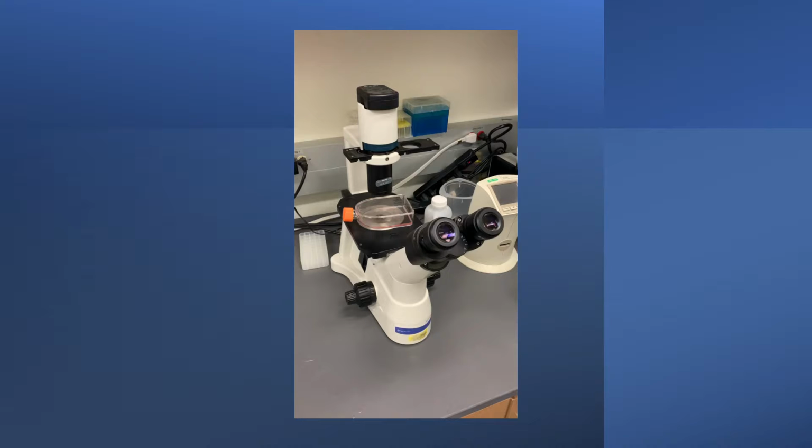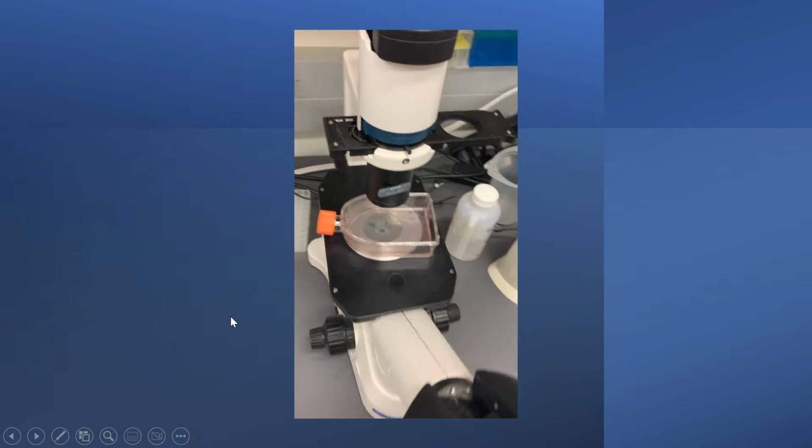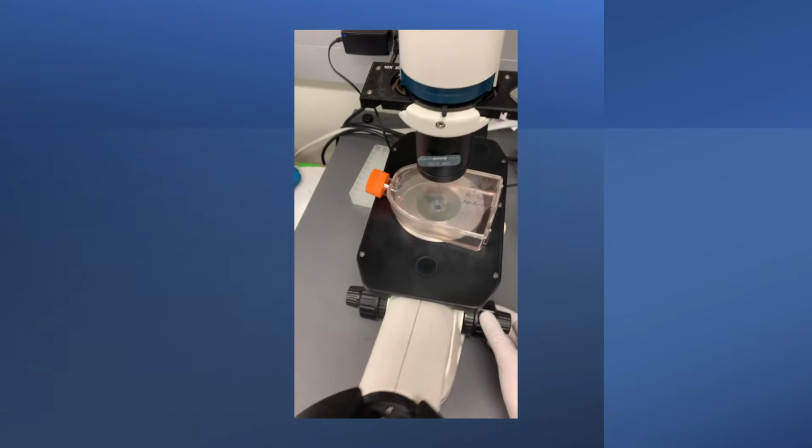So here is a video showing me looking at these leukocytes, and this was the day before yesterday, I think it was yesterday actually. I was checking to see the confluence and whether I needed to split the flask, and as you can see that is a very full flask. That is 4x objective I believe, so that should be a 40 overall magnification.